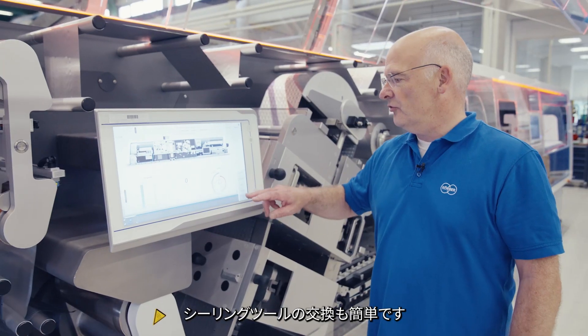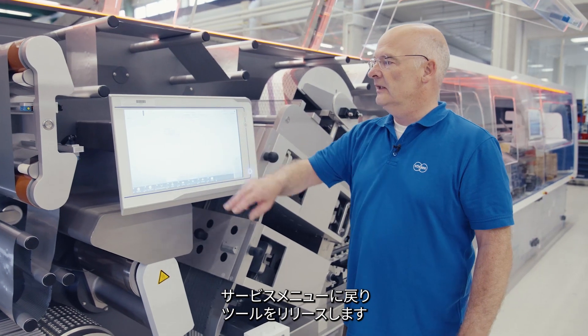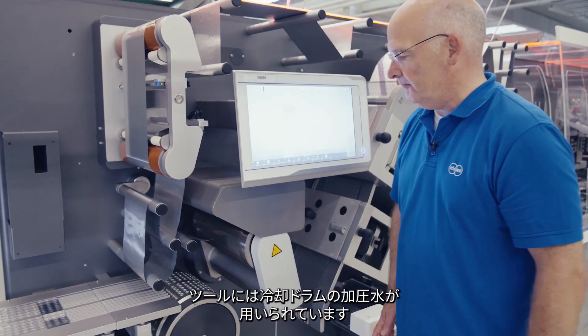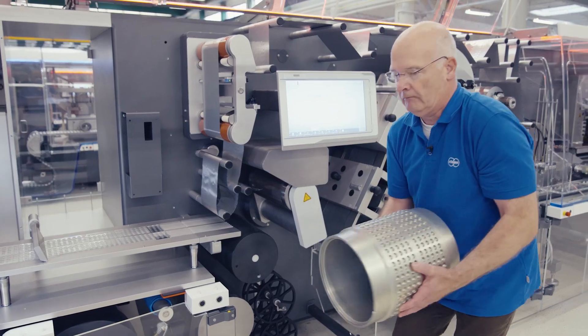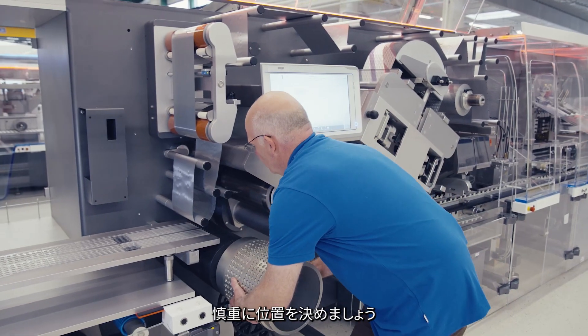Now let's see how easy it is to exchange the seal tool. You go back to the service menu, release the tool, which is done by pressurized water in the cooling drum. The pressure is now off and I can remove the seal drum easily. Then the same way back into the machine — I position it here carefully.